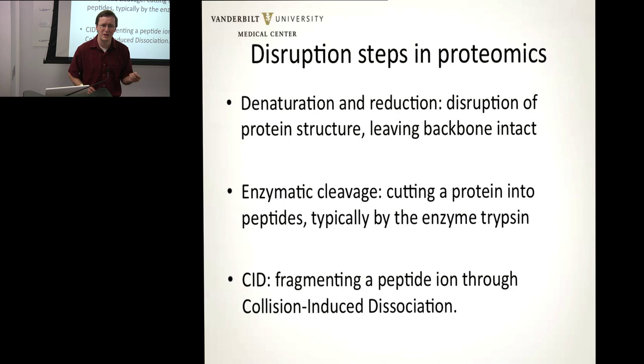So by making the mixture even more complex as a first step, you might think you've taken a big step backward in understanding it. But in fact, peptides are a whole lot easier to deal with. They're a whole lot easier to separate and to get back from your column after the fact. They're a whole lot easier to do tandem mass spectrometry on and get structurally informative tandem mass spectra back. So we're going to turn them into peptides at this stage.